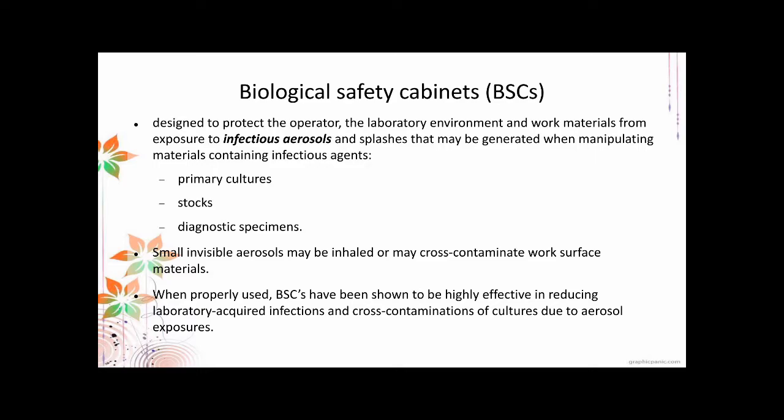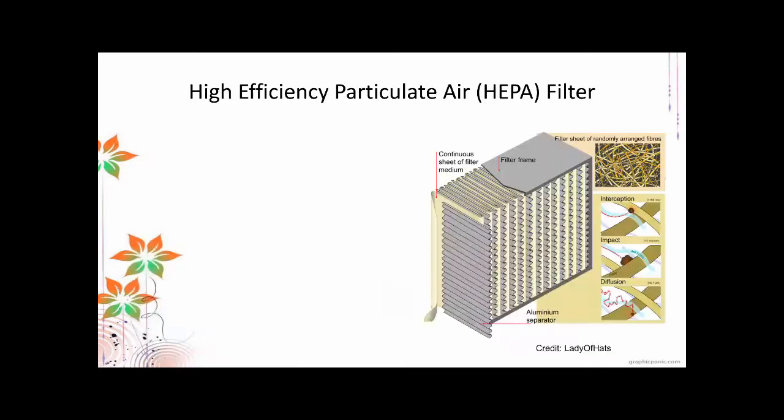When properly used, BSCs have been shown to be highly effective in reducing laboratory-acquired infections and cross-contamination of cultures due to aerosol exposures, because aerosols happen, and they are usually invisible to us. And remember, the agents that you are handling in a biological laboratory are, of course, microscopic. So the BSCs also help protect the environment by containing the infectious agent inside and preventing its escape.